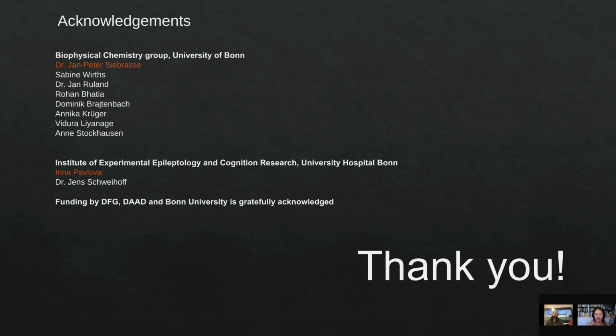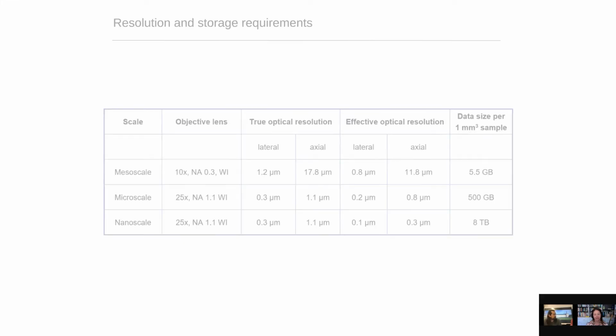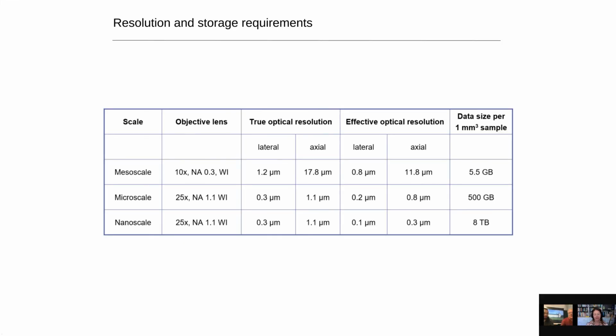Next question. How heavy are the images obtained? How to handle heavy images? Yes, that's true, and that's why it's also recommended, or that's why we jump between different objectives depending on what we want to image. Ulrich could explain. Yeah, we expected such a question.